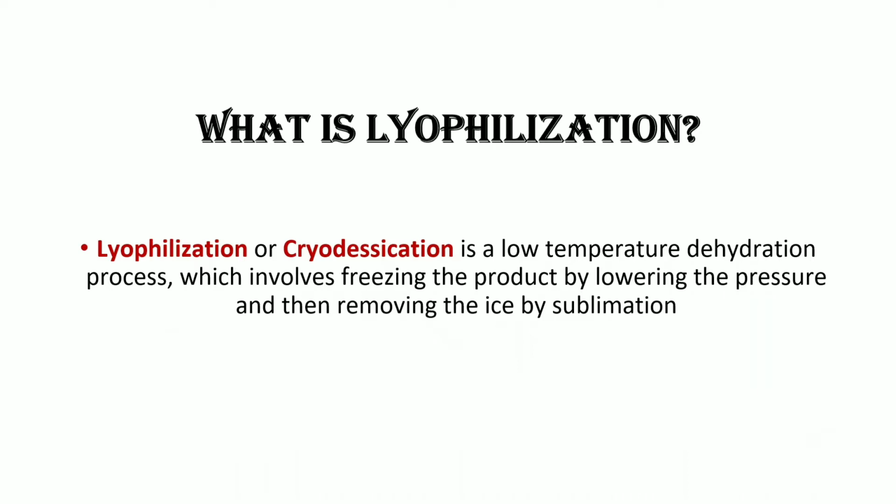But what is lyophilization? Lyophilization is also called cryodesiccation. It is a low temperature dehydration process. In this, water will be removed at a lower temperature. This involves freezing the product, lowering the pressure, and then removing the ice by the sublimation process.